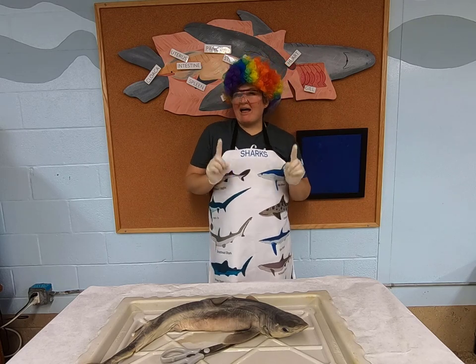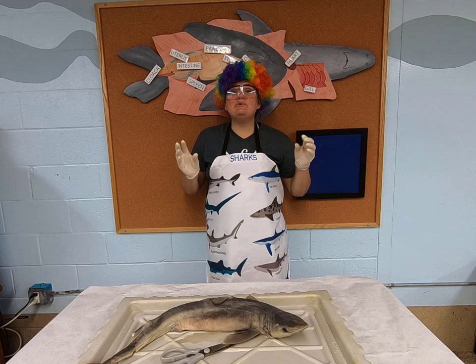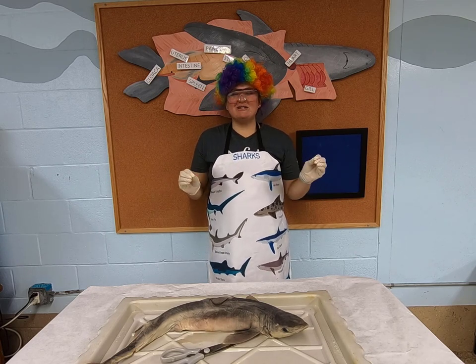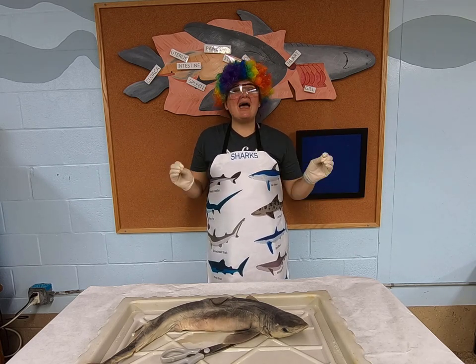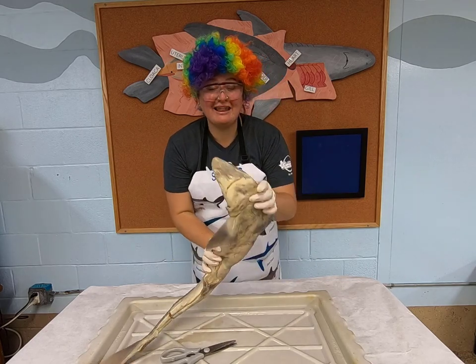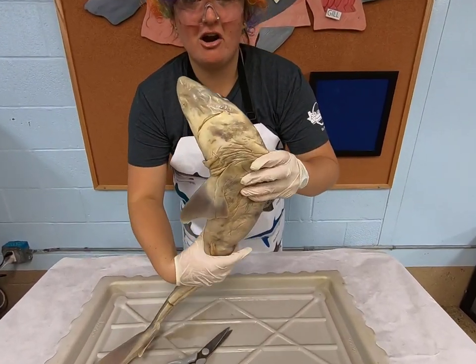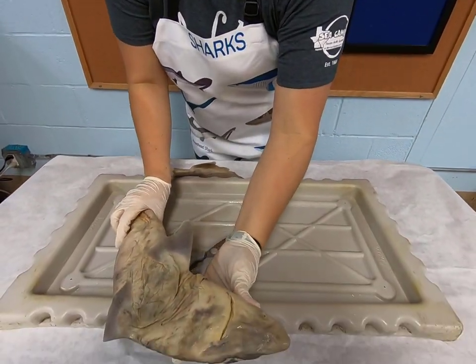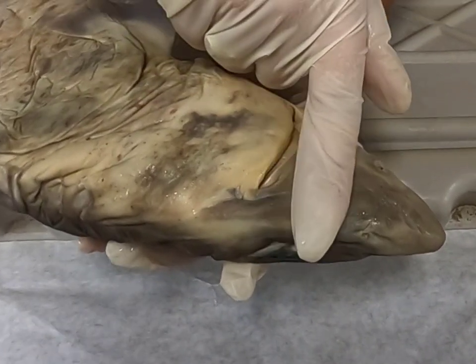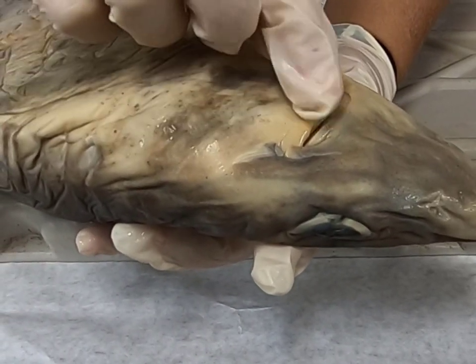And let's talk about that last sense, that sixth sense. Sharks have an organ called the ampullae of Lorenzini. Everyone say that with me. Ampullae of Lorenzini, all right? The ampullae of Lorenzini is a series of pores on the snout of the shark. So the shark has these pores going all along their snout. You can even kind of see them here.